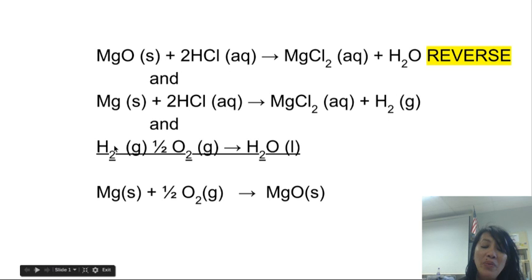The third reaction I can't perform in a calorimeter because it is also highly exothermic, so we use the table of heat of formation values to locate that value. Once I have the heat released by each reaction, from calculating Q is mc delta T, where m is the mass of the solid as well as the volume of the solution converted to grams using the density of water.